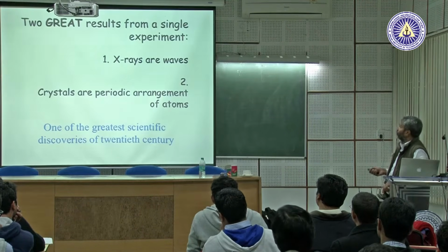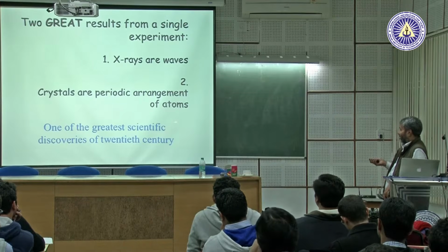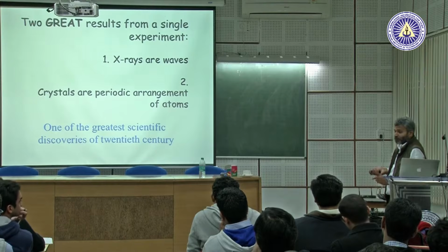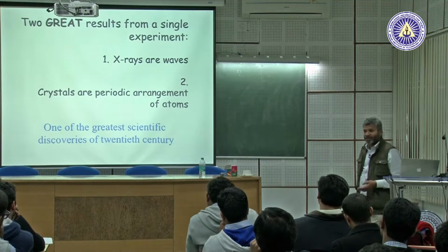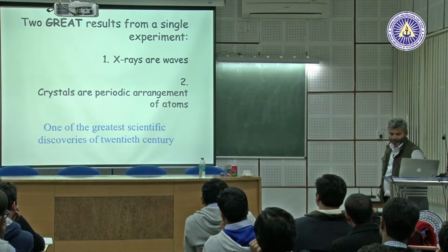Once you get the success of this experiment, that is why it is called the greatest science, because two of the greatest questions, not one but two, were answered in the positive: that X-rays are waves and crystals are periodic arrangements of atoms. This started modern crystallography, which I call X-ray crystallography.